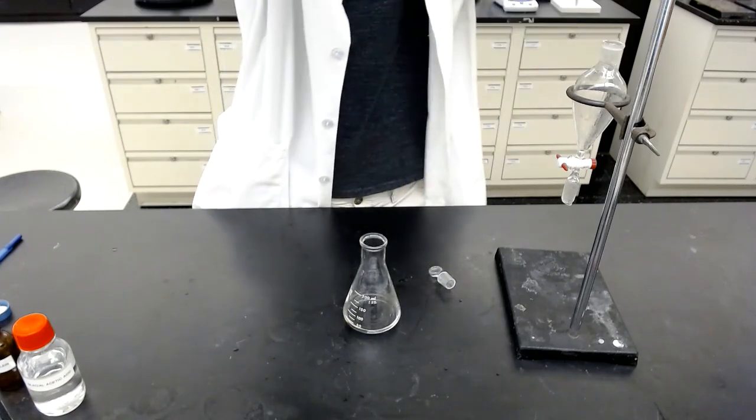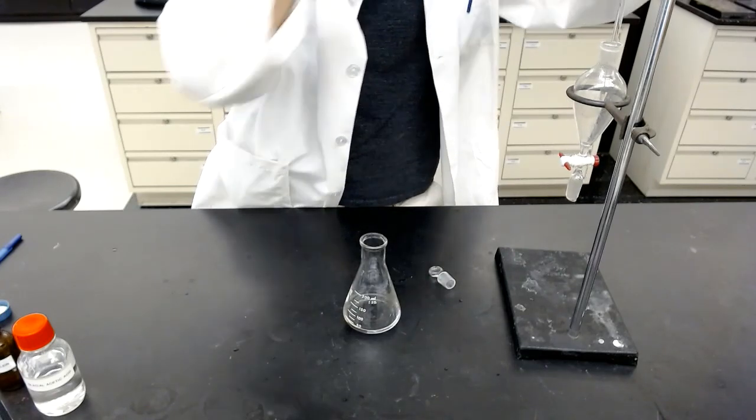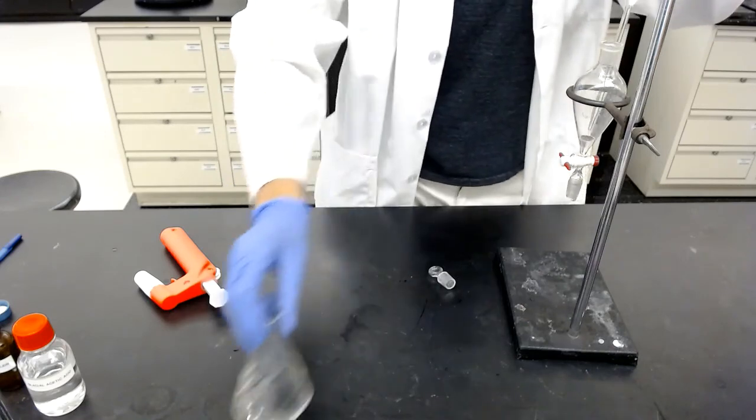Okay, 10 ml transferred to the separatory funnel again. Alright, that's the easy part.